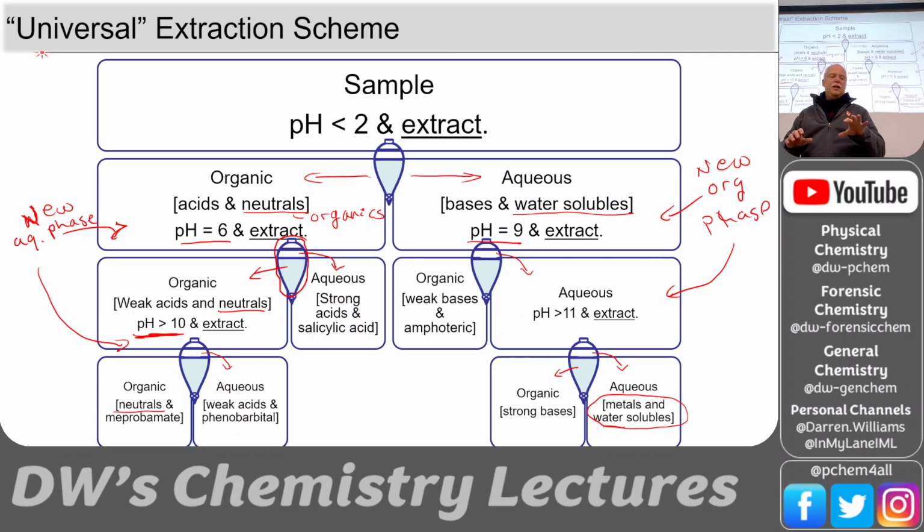And then also they are very, very flammable and they're heavier than air. So they creep. And so you may be working at the lab bench and they creep over here. And this is not so dangerous here at our labs because we don't have sources of ignition around. But if you're working in your garage, I have to do a little public safety announcement here, something you brought up, ether.